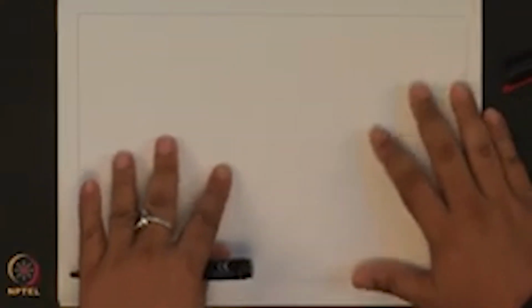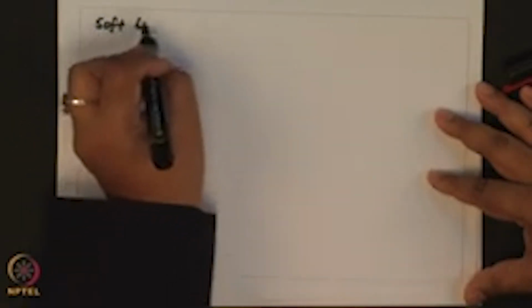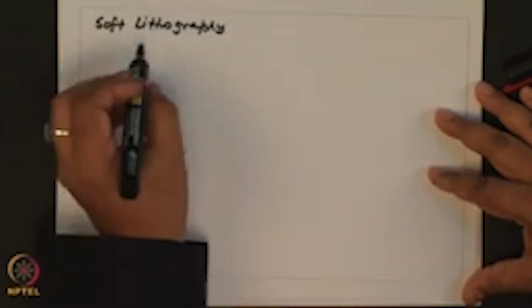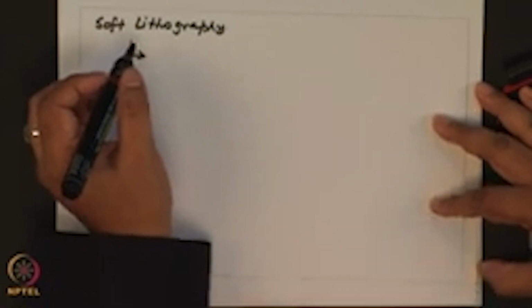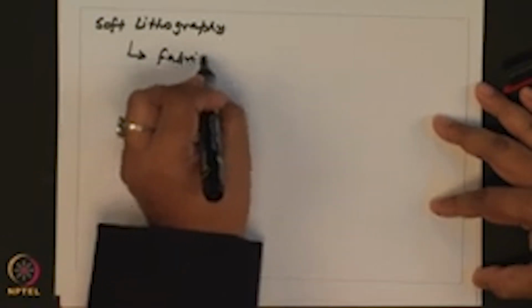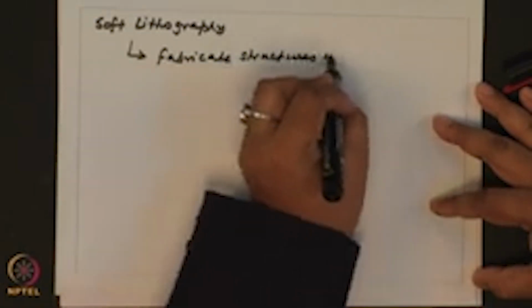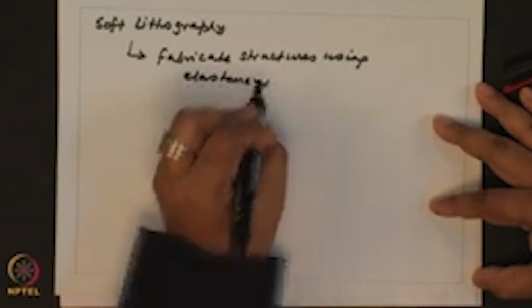Now, this is broadly lithography. What is soft lithography? Soft lithography is what is used for biology applications. It refers to a family of techniques for fabricating structures using elastomers.